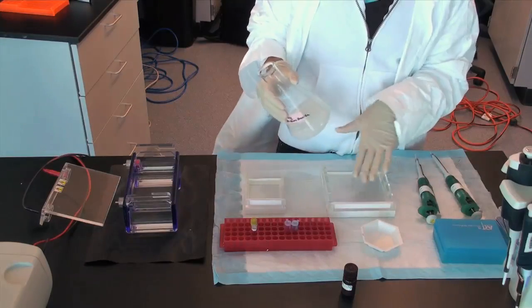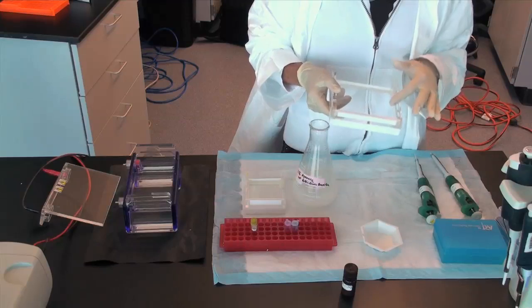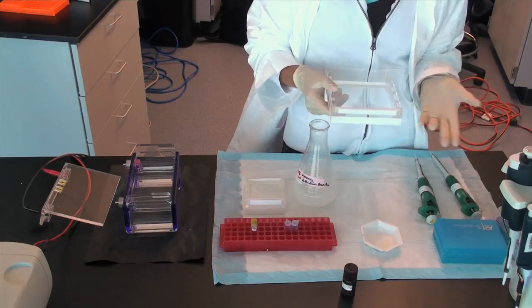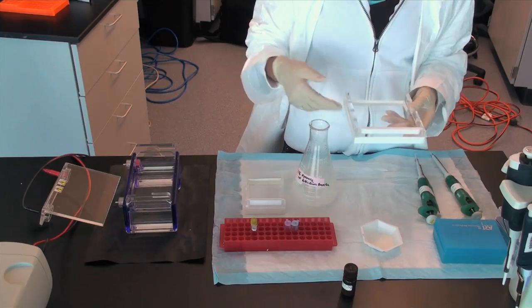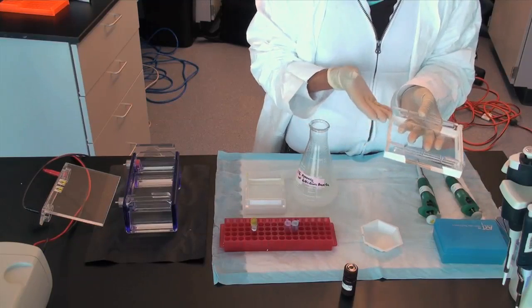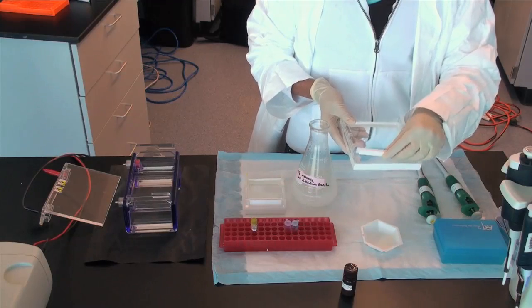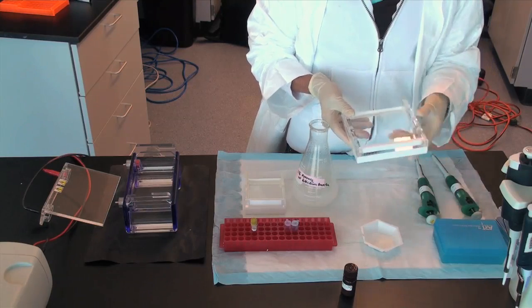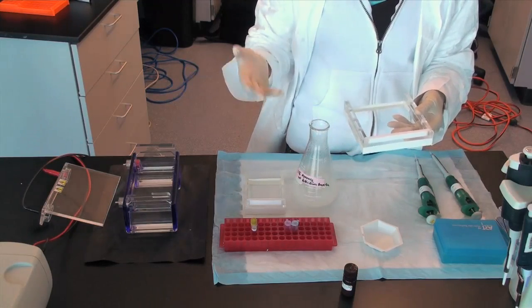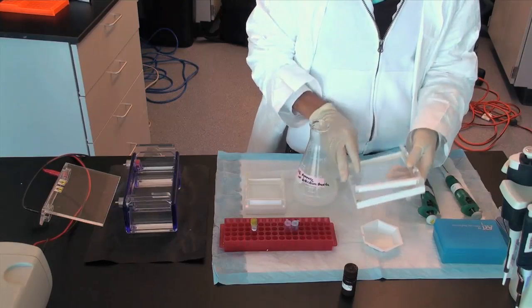Pour the liquid gel into the casting tray. The liquid should not be too hot when poured or it will crack the casting tray. However, it should not be so cool that the agarose and buffer start to solidify. The casting tray should be appropriately sealed with tape or rubber and a comb placed into grooves of the tray in order to load DNA. The size of the comb depends on the number of samples and the volume of DNA you are interested in loading.